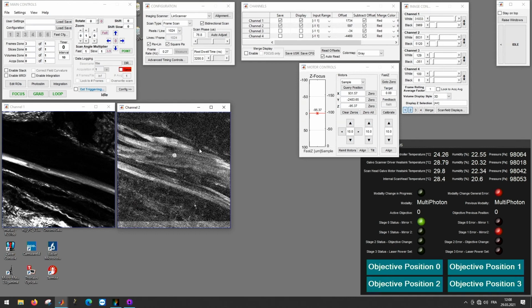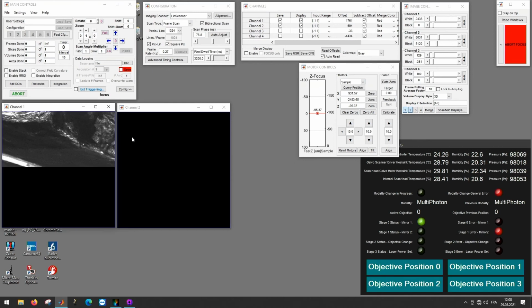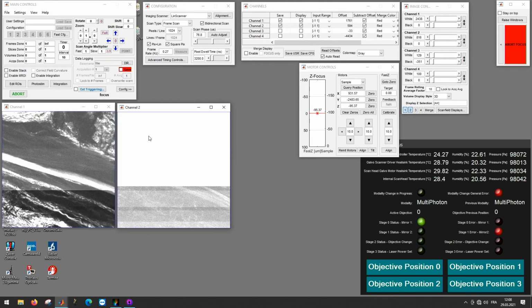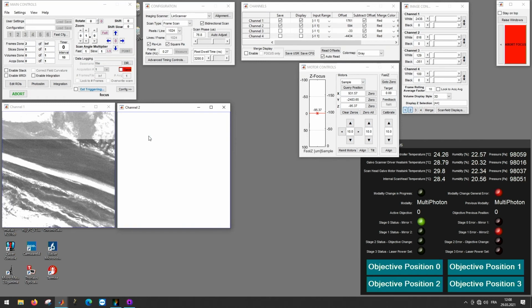Because we are looking at the autofluorescence, it could happen that you don't have a strong signal, like in this two photon channel over here. Then you can just increase the number of images that will be averaged and start focus again. And now you can see that with every frame the image is getting a little bit brighter.